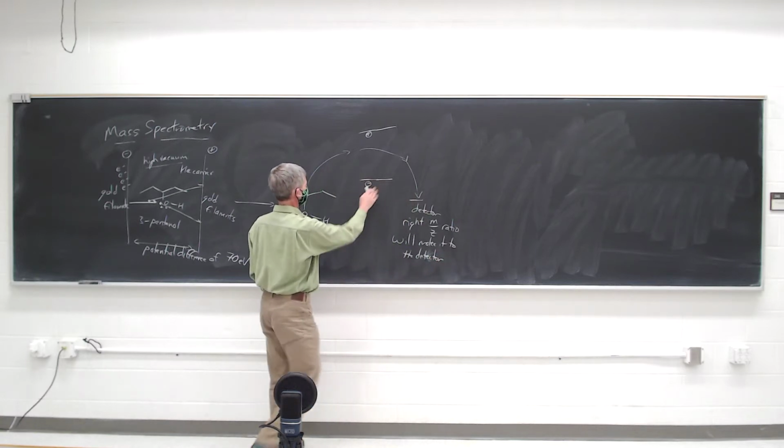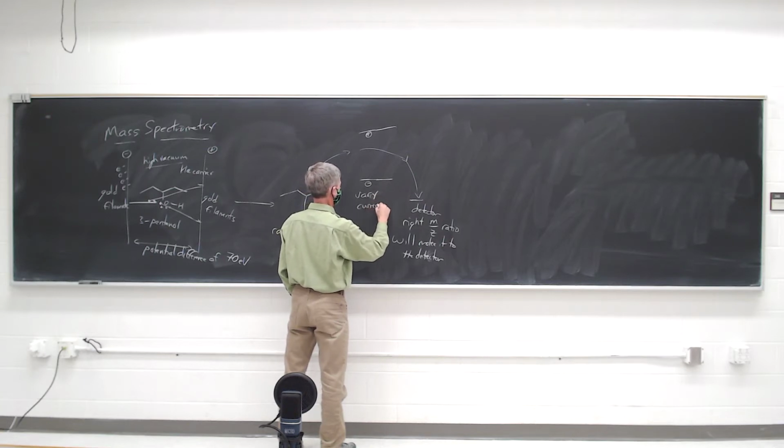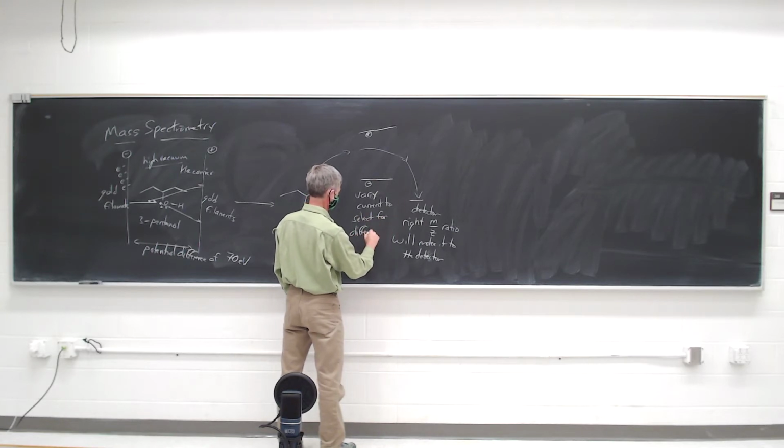So we can vary the current on these things to select for different mass to charge ratios.